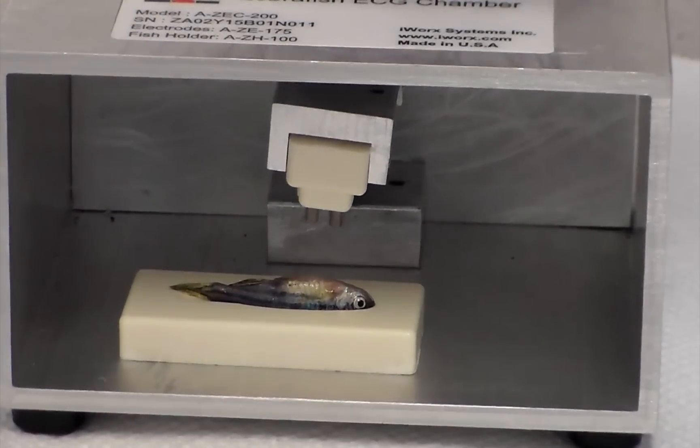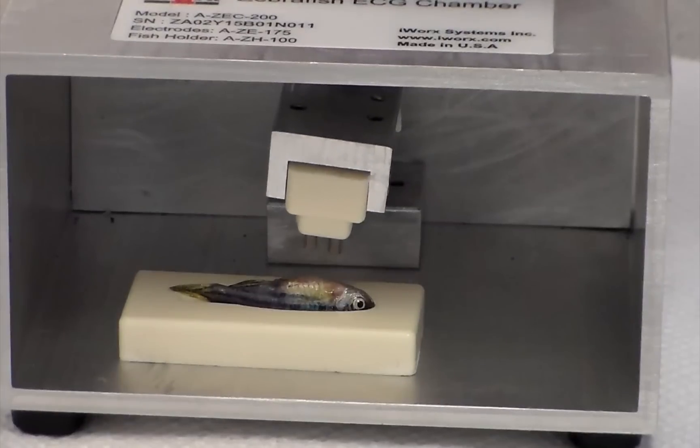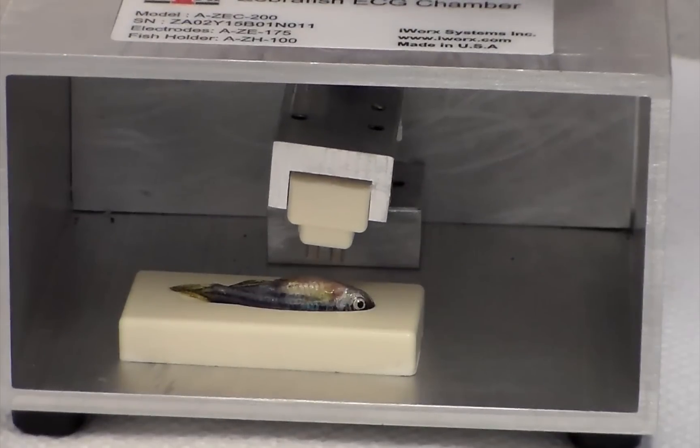Using the turn screw positioner, the electrodes are then gently lowered to make adequate contact with the fish.